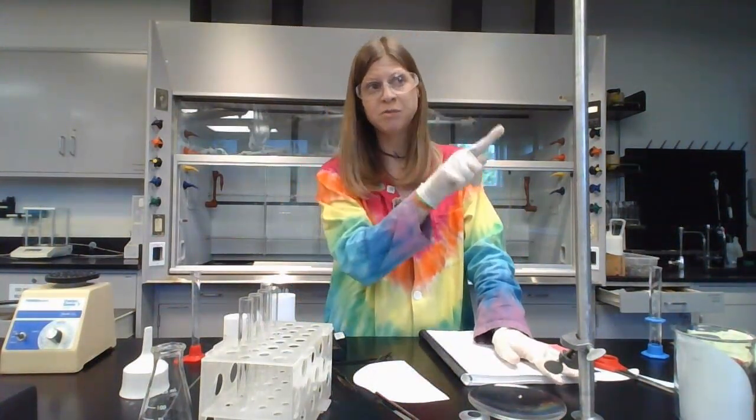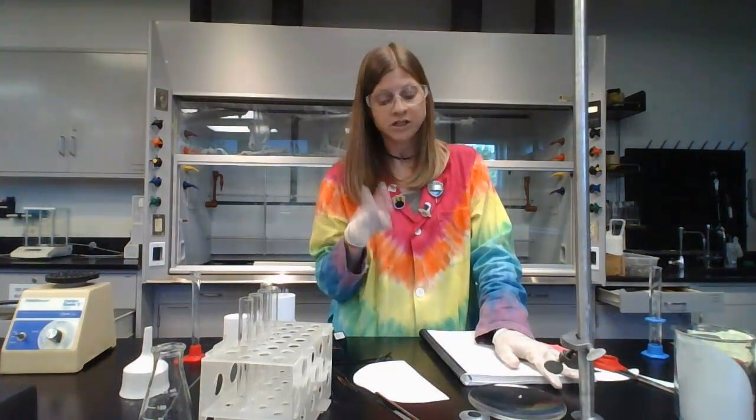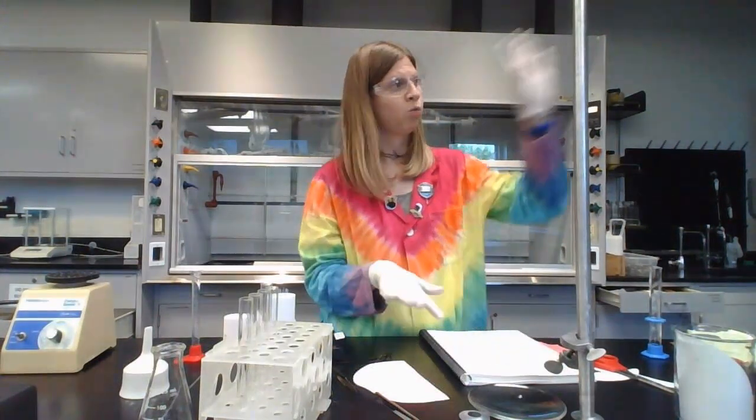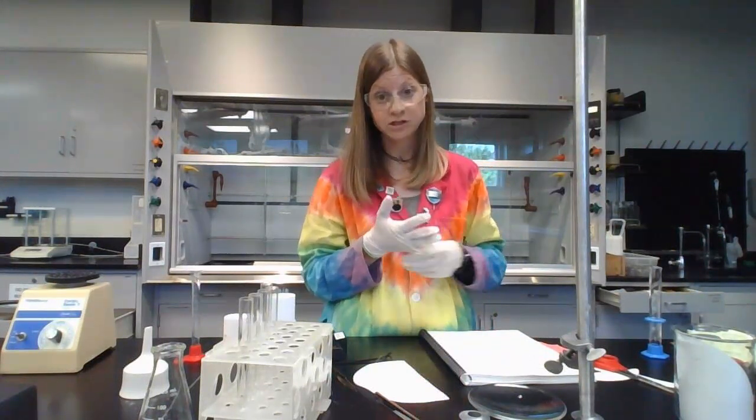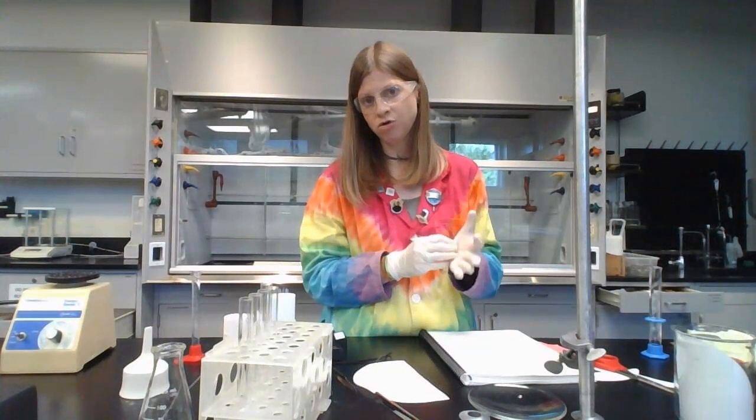So at that point, we've done all 3 things. We did our color test, which we did at the beginning and then finished at the end. We did our TLC, which we're doing while the product, the aspirin, is drying, and we made our aspirin. Okay, so we got all of them accomplished. It was just kind of in the order in which it took.